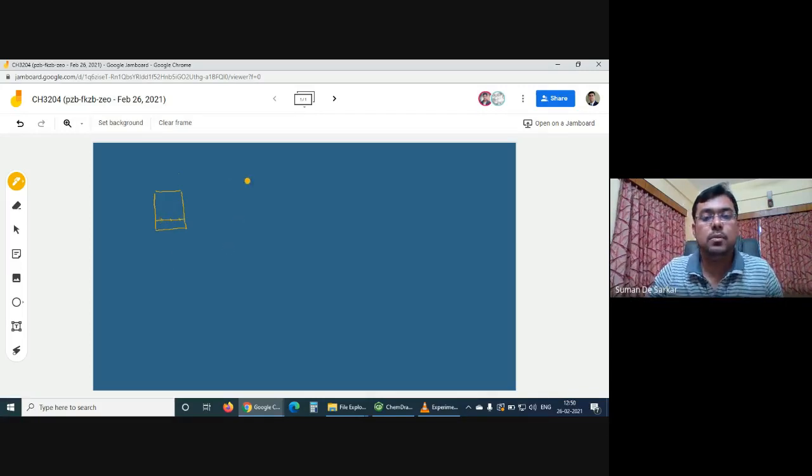Okay. And suppose this is a reaction, A to B. A is the starting material and B is the product. Let's take P as the product, and instead of A, take S. This is the starting material, S, and P is the product. Then it's better. Okay. So in a typical TLC, you have to do like this. You have to put three marks.